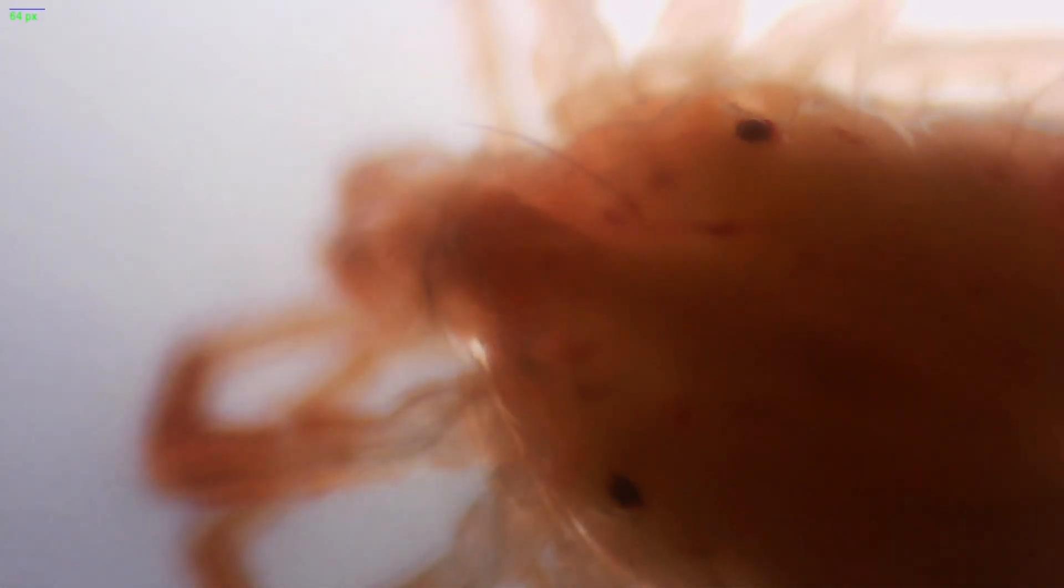We are now looking at the top view of the mite. Now this fella I accidentally unalived in the process of capturing him and so that's why he is not moving. But he probably was honestly eating my flowers that I had recently planted. I noticed all the leaves were gone and that was probably either snails or mites. But either way rest in peace to him.